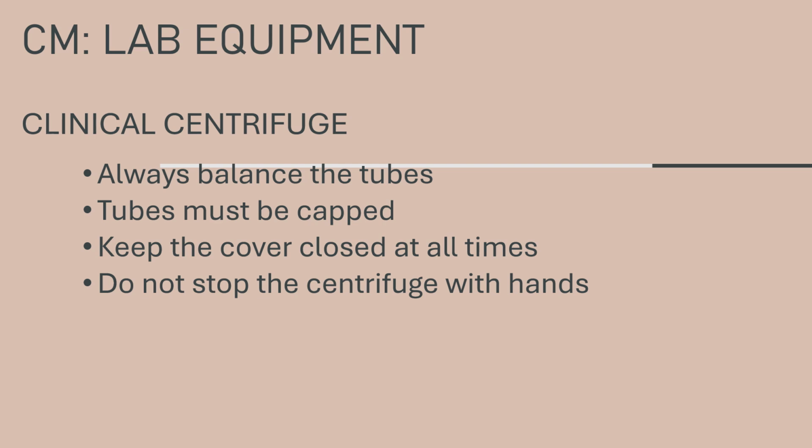Also, you clean and disinfect the rotor and the chamber after use. Daily, you clean and disinfect your centrifuge. In case there is a spill, it should be cleaned immediately. In cleaning and disinfecting, please consult your manufacturer's manual, because there are cleaning or disinfecting agents that may corrode the materials of your centrifuge.